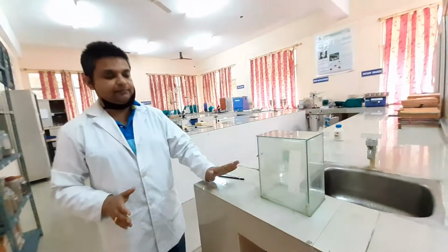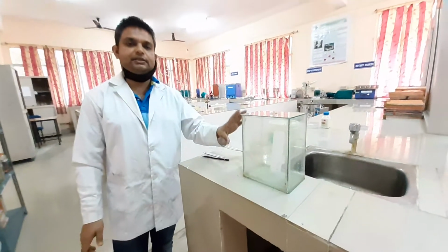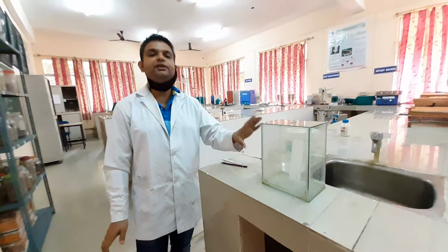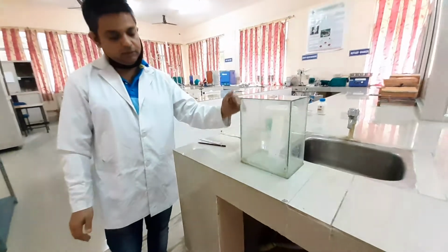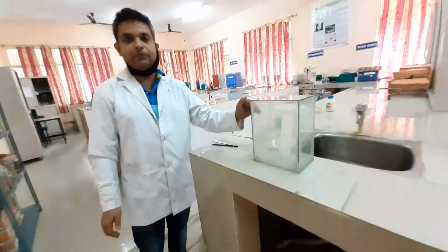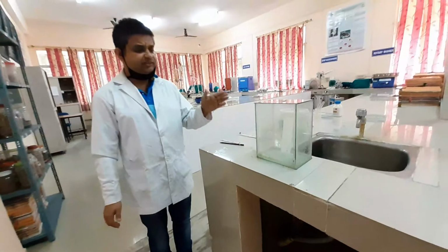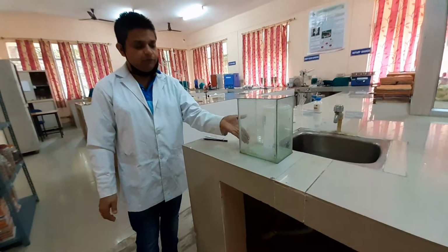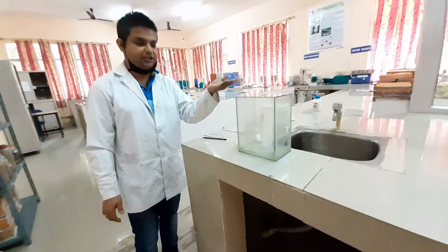Now you wait for some time till it reaches the solvent front. Here as a solvent front we have already pre-measured 10 centimeter. When the solvent reaches up to 10 centimeter, then we will take out the plate. The solvent will move against the gravitational force due to capillary action.